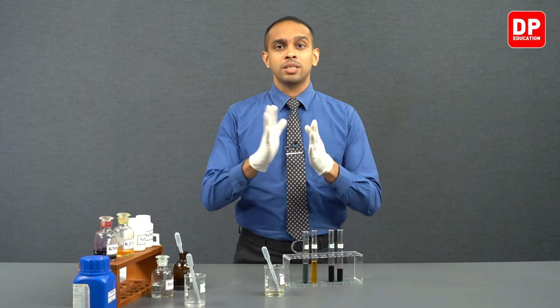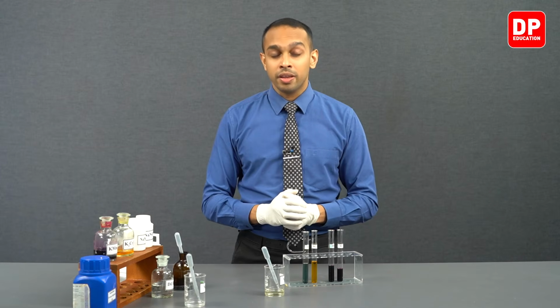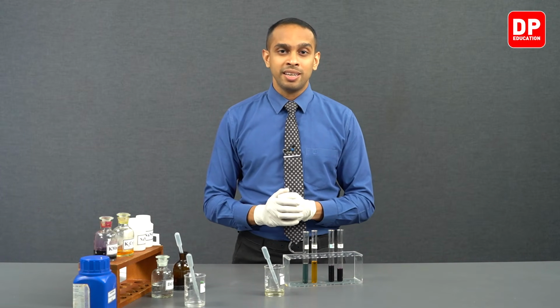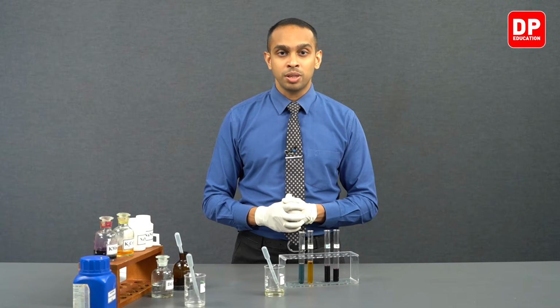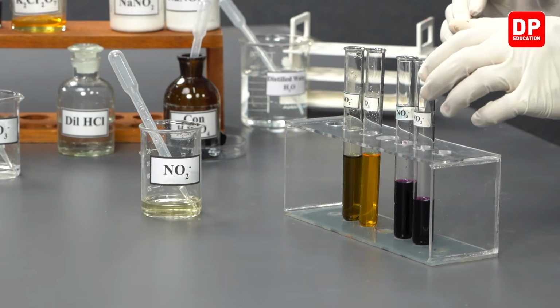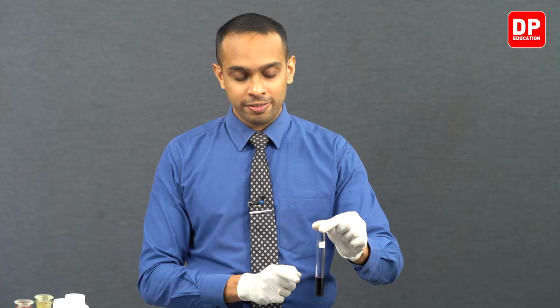So as they get oxidized into nitrate ions, you will see the dichromate ions get reduced to form chromium 3+ ions, and chromium 3+ ions along with water ligands and sulfate ligands that are present in the aqueous medium will form a green color complex, and that is why we observe the green color solution that we observed earlier.